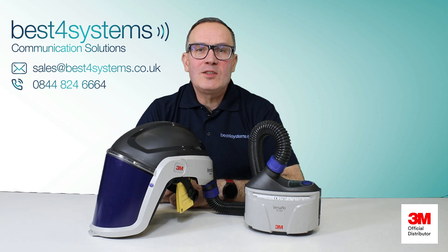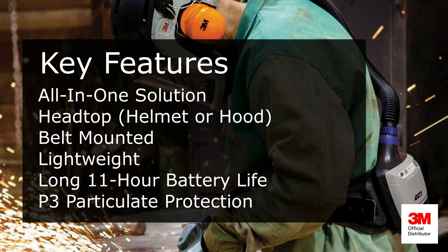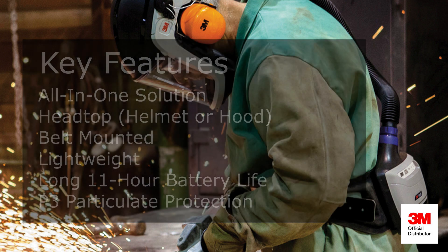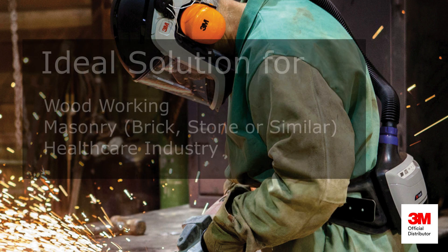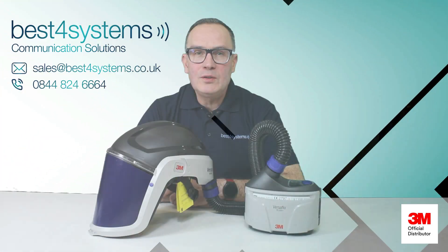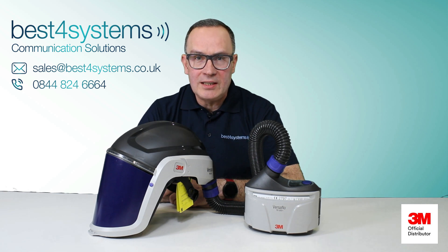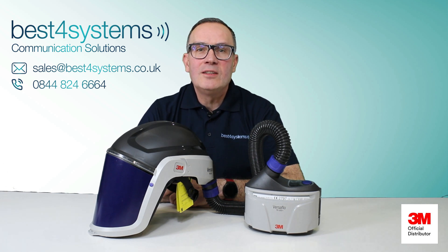The TR315 starter kit comes with everything that you require, and once purchased with your choice of head top, it's a complete solution. It's belt mounted, a lightweight unit with a rechargeable battery that will give you 11 hours of use. If you're working with fine particulates above the safe workplace exposure limit, then this really is the ideal solution for you. Filter length will vary depending on a few factors; however, the powered air unit will give you an alert when your filter is down to its last 25%. So let's take a look.